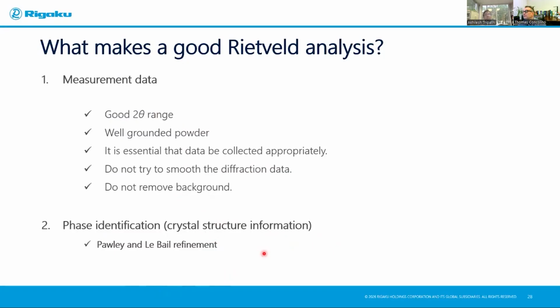But I also want to mention one thing that I promised. Remember, it was written WPPF, whole powder pattern fitting. What if there are certain materials for which crystal structures have not been found? Some of you who work in minerals know that smectites such as montmorillonite do not have a crystal structure yet known to human beings because it's a disordered structure. It's hard to get the molecules in place.